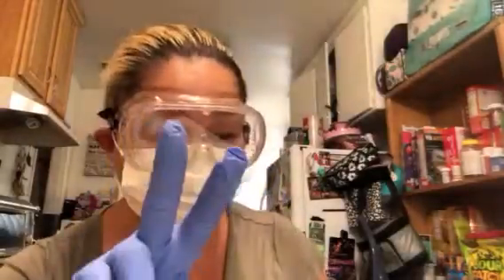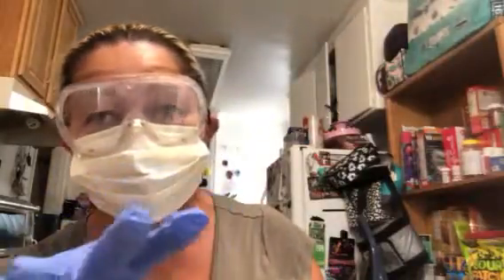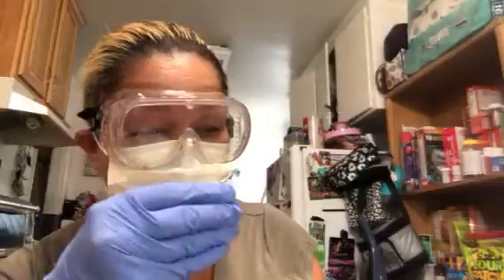NaCl at 1%, NaCl at 7%, NaCl at 15%. So there were 6 total, 2 at 1%, 2 at 7%, 2 at 15%, and then we split them up by S. cerevisiae for the 3, and then S. epidermidis for those 3. So these are the results.